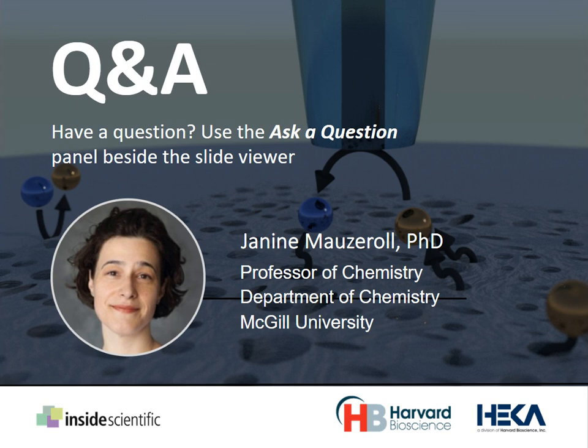Excellent, great answer. Question here from Daniel, who said, thank you, Janine, for the nice presentation. Have you seen any effect of agglomerated LFP particles versus individual particles from the droplet measurements? For sure, there is a difference. And for NMC particles that tend to have larger aggregates, yes, you don't get the same response. Like the current will be different.